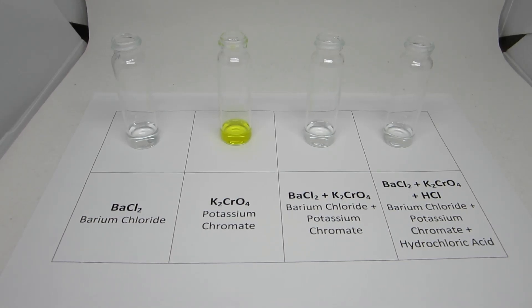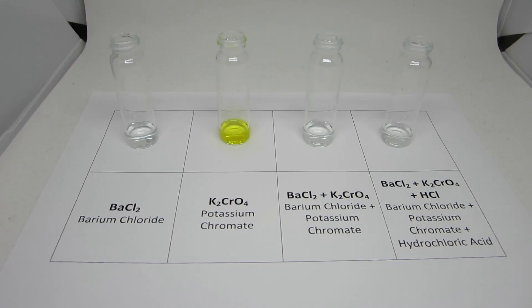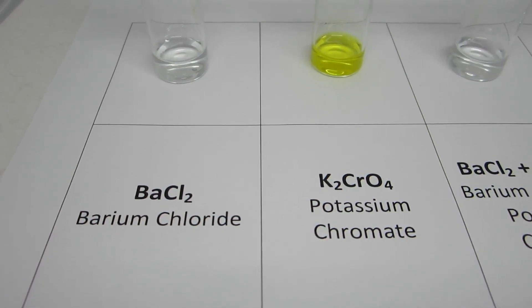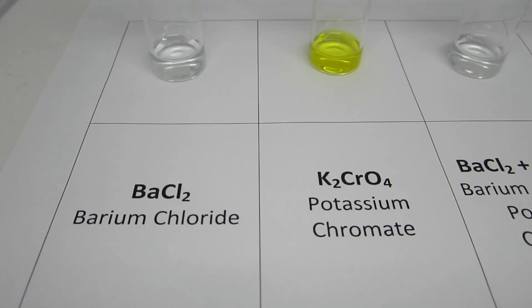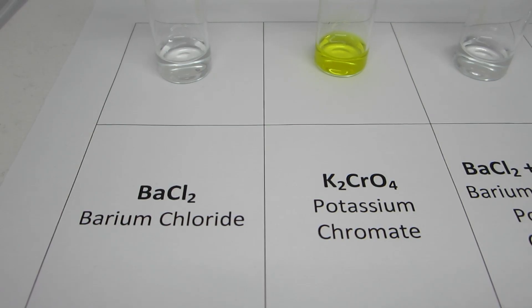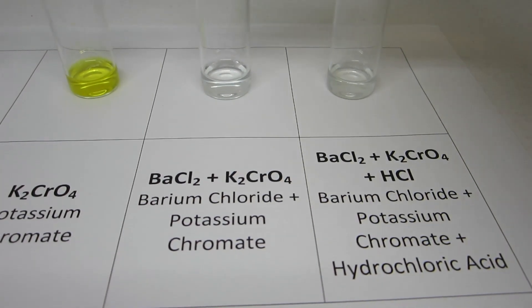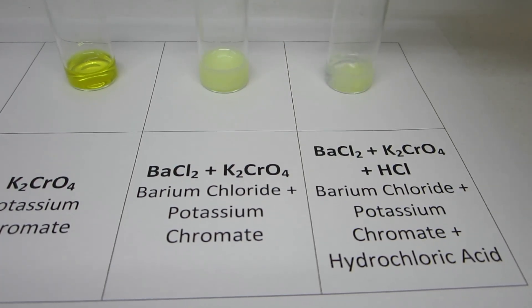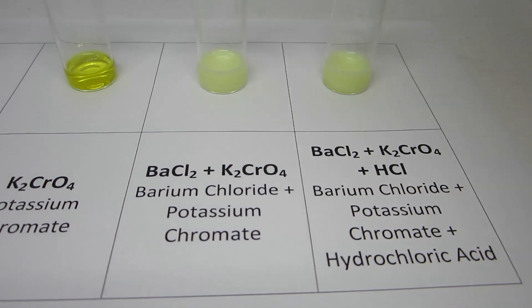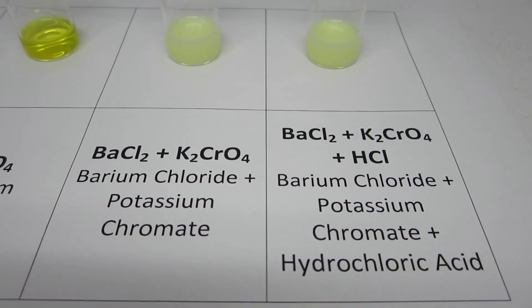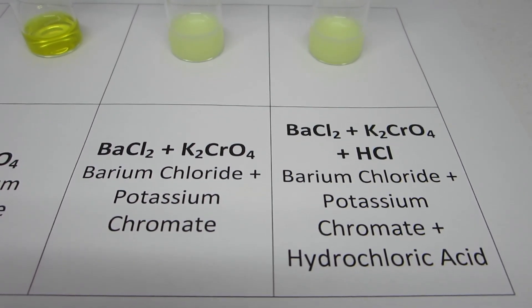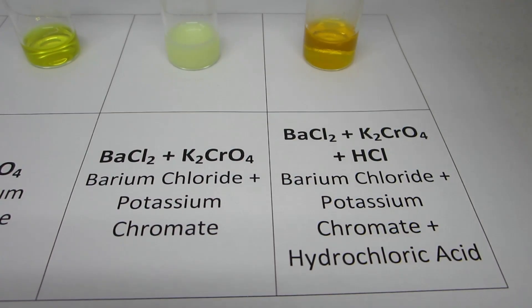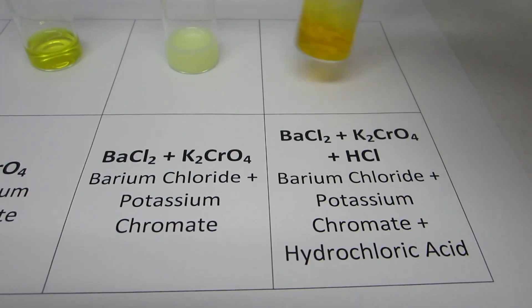The second equilibrium reaction to investigate is the precipitation reaction of barium chromate. The initial reactants appear as a yellow potassium chromate solution and a clear and colorless barium chloride solution. Upon mixing, the dull pale yellow precipitate of barium chromate is formed. With the precipitate formed, the addition of hydrochloric acid causes the precipitate to dissolve and the solution to appear a golden orange color.